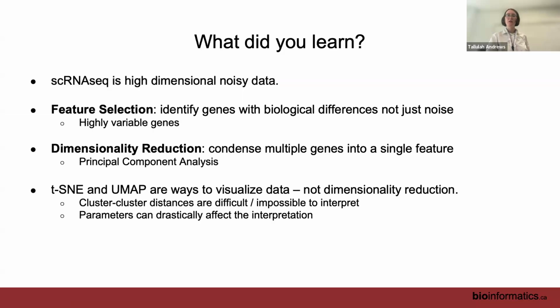Do I have any questions? So Ottawa asks about t-SNE's reproducibility issue. Both UMAP and t-SNE involve random number generation, so both of them are not reproducible unless you set the seed. And the new t-SNE is much more reproducible than the old t-SNE.